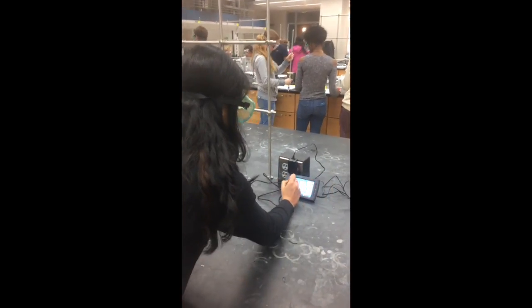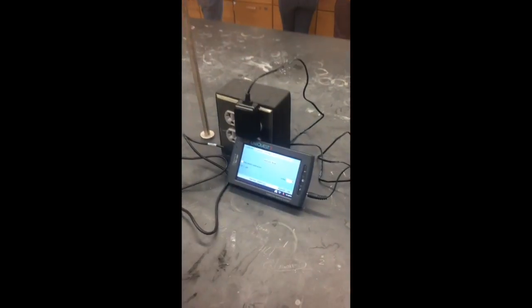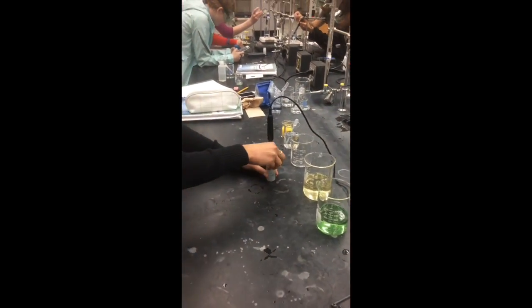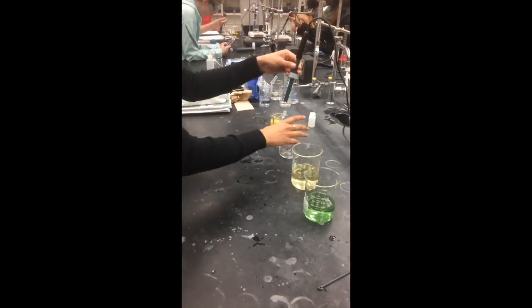As this video progresses, you will see the calibration and use of a pH meter. While this goes on, I will be talking about some important points that are necessary to know to understand the concept of pH and some other factors that are related to it.